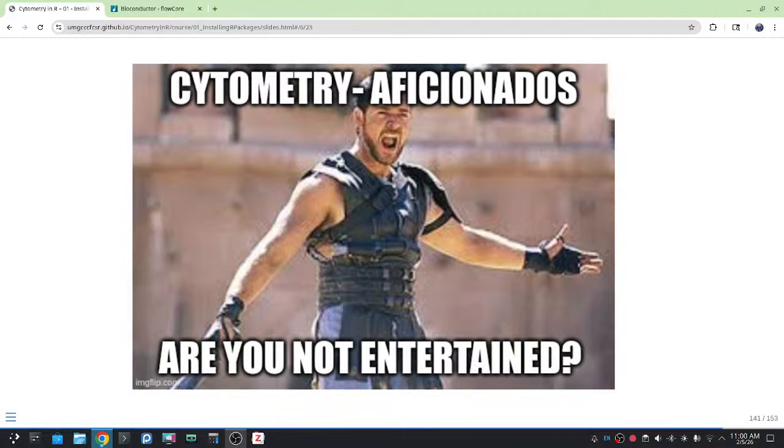None of this is intuitive. Why some things have parentheses, why some things don't, why there's 3 different sets of installation commands for 3 different repositories. None of this is particularly easy. We have all been in your shoes. It's something that we are going to learn just by using packages over longer periods of time, troubleshooting, figuring these things out on our own.